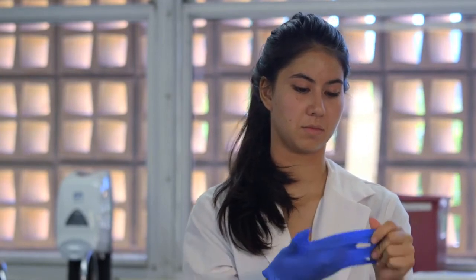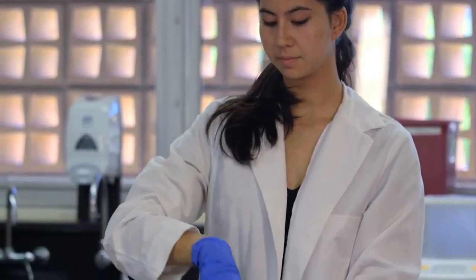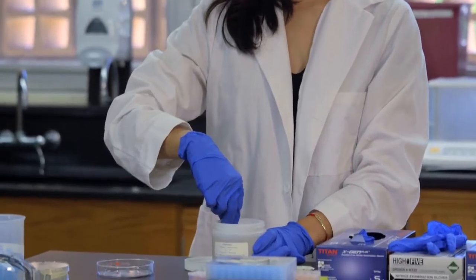Several of the laboratory sessions this year will require you to use various equipment to protect yourself and others from potential hazards. This personal protective equipment may include lab coats, safety goggles, and gloves. When directed by your TA, wear disposable gloves while handling potentially harmful chemicals or organisms.